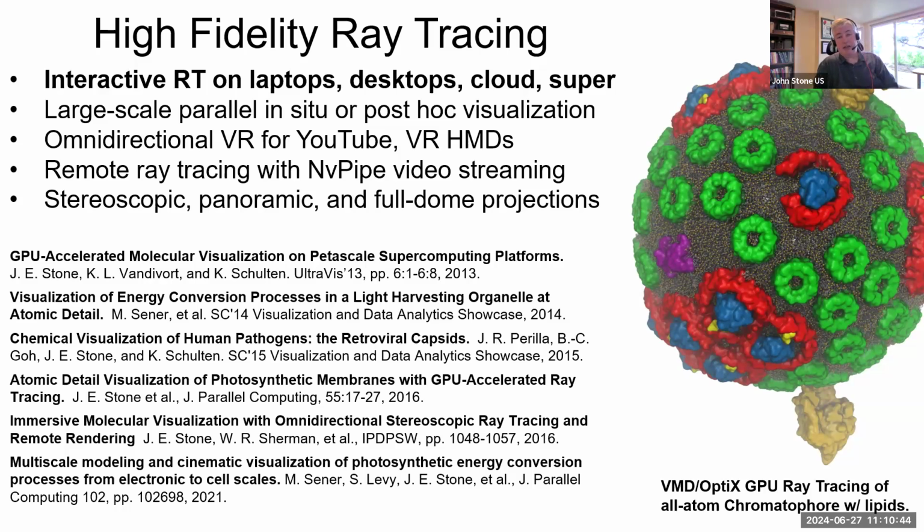So this goes back actually something like 22 or 23 years. VMD began incorporating ray tracers directly in the program. They're actually compiled into the software, and as a result, VMD is designed to work well for both conventional rasterization, which is what you used to see in video games and so on, and the ray tracing methods that are now state of the art.